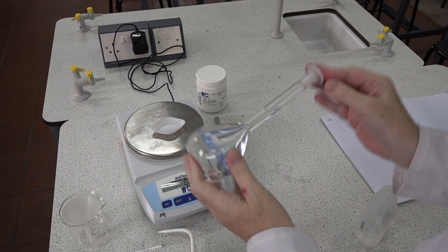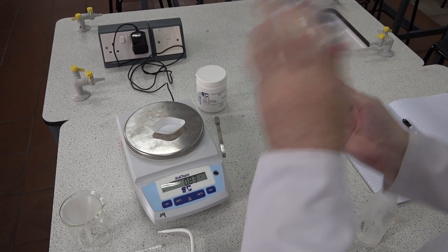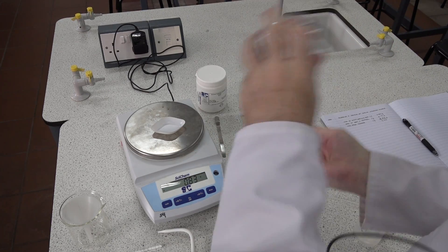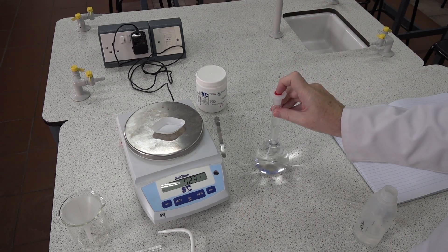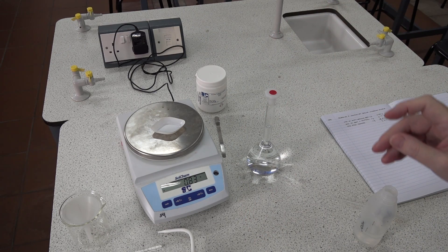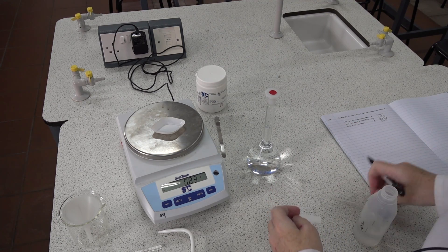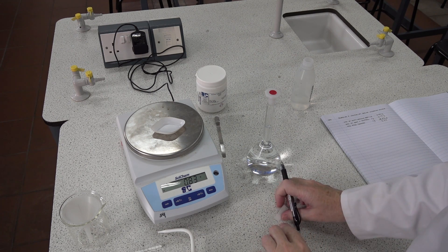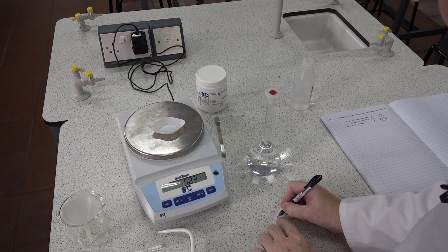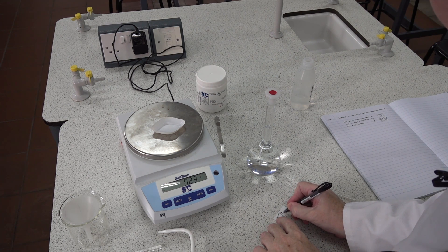We need to invert the flask and shake — five times usually suffices. The last thing we need to do is label our solution: sodium hydrogen sulfate, with 3.3 grams in there.